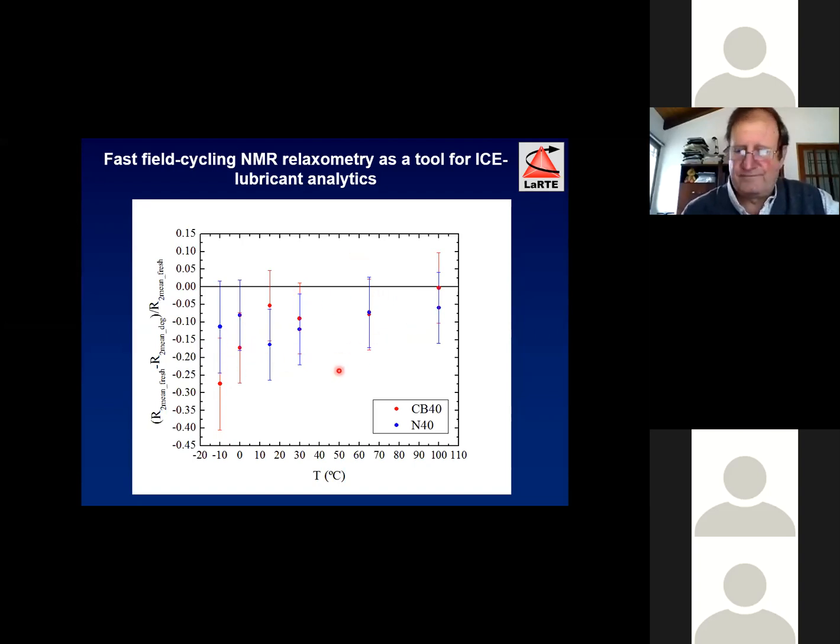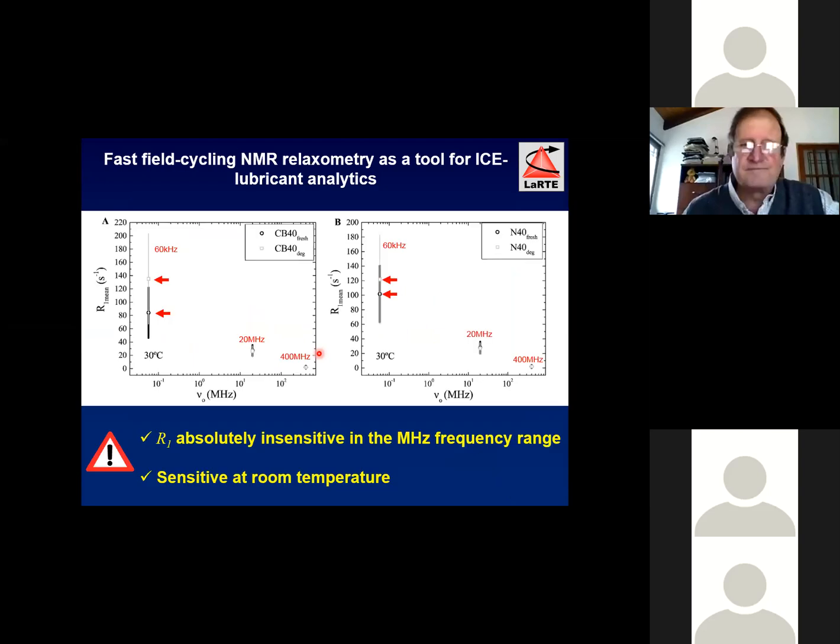Okay, here we compare for the base and for the lubricant. You see, by the way, that the lubricant seems to be a bit more resistant to the degradation, yeah? Because it's closer to no change between degraded and fresh.